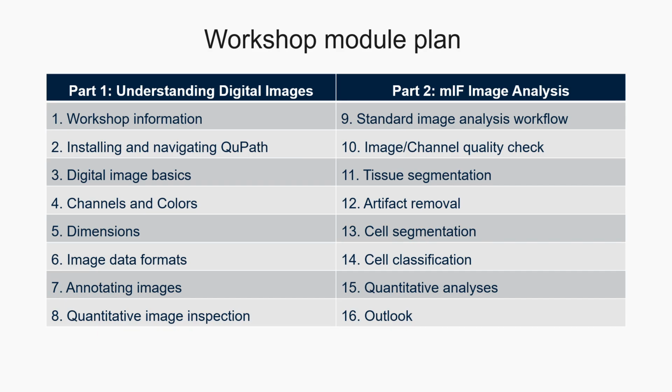The first part of this workshop will focus on understanding digital images and the concepts that relate to them, all using QuPath. Then in part 2, we'll focus on how these concepts relate to multiplex immunofluorescence images and performing the tasks necessary to analyze them.